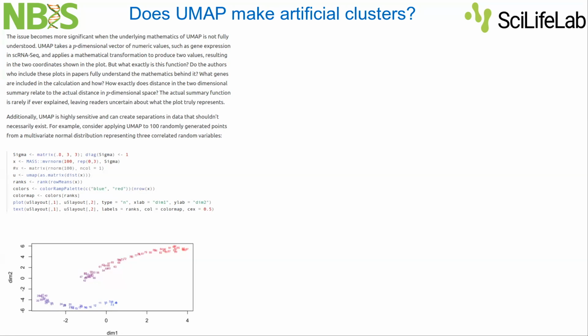You apply dimensionality reduction and UMAP from a situation where all of them are individual clusters, and then they kind of clump together gradually. And at some point you can stop and say, so this is what makes sense for me. This is how I understand my data.